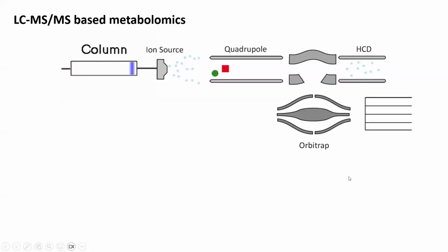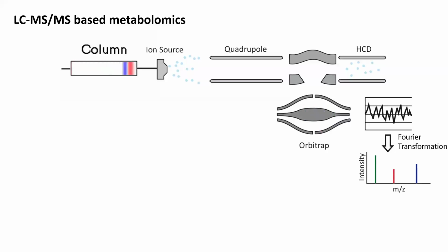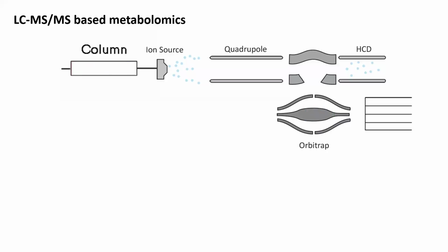Okay, you probably already saw this slide, but it's important at this step. I know that some people are already doing these experiments, already running their LCMS run, but I also know that some people are not. So I want you to stop me if you don't understand something. When we analyze complex samples like in ecology and eco-metabolomics, of course we have really complex samples.